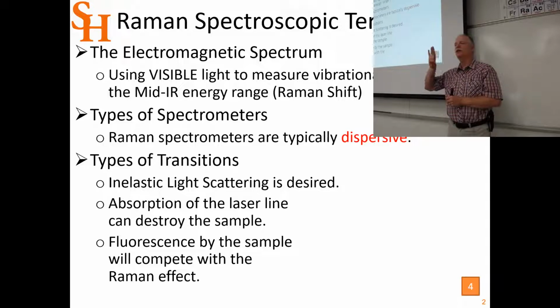So that red shifted light is very broad in its emission, and the Raman spectrum is very narrow. So the Raman transitions are very narrow peaks corresponding to the vibrational spectrum of the molecule. But fluorescence is an electronic spectrum. And electronic spectra are very broad. So you get all of this smear of light, and on top of that is your tiny little Raman signal. So it just overwhelms the detector, and you don't get to see the Raman.